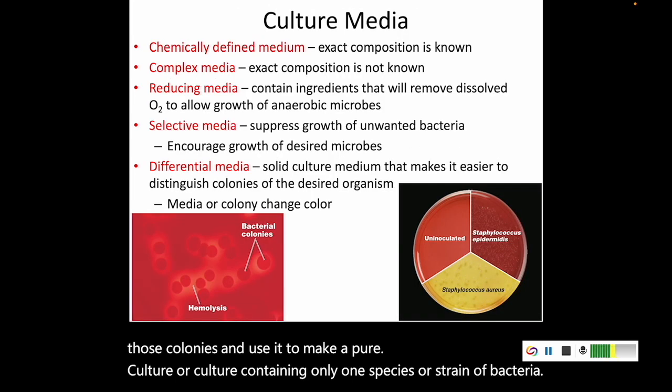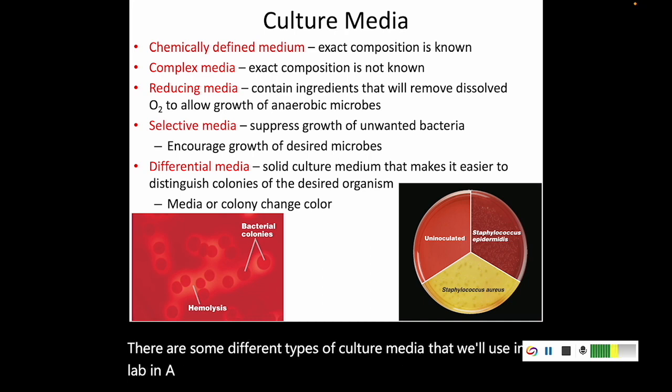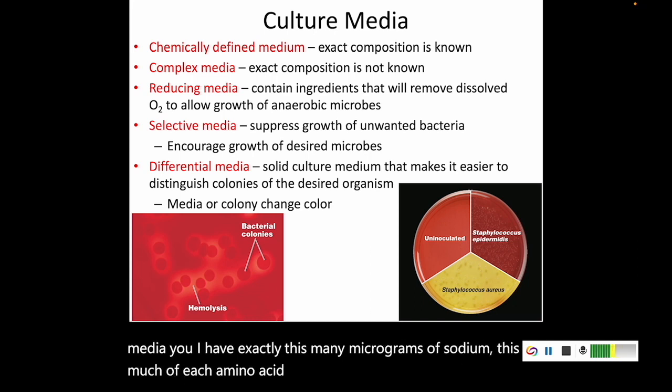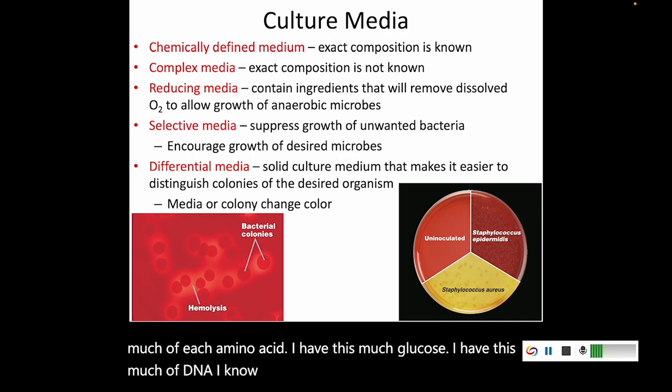There are some different types of culture media that we'll use in lab. In a chemically defined media, you know exactly what is in that media. You know I have exactly this many micrograms of sodium, this much of each amino acid, this much glucose, this much DNA. I know exactly what's in it.